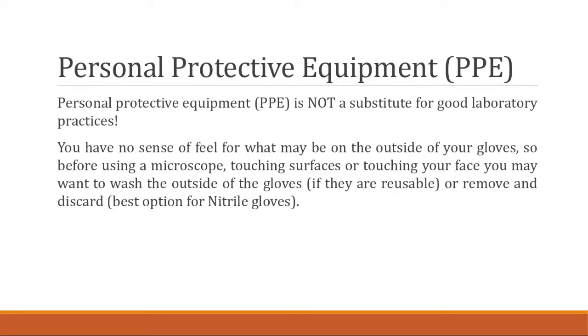So what's nice about our lab, we have a set of nitrile gloves that are utilized for any of the metallographic preparation and chemical use for etchants. Then in the microscopy lab, we have a separate, different type of glove that's used for the operation of the microscopes.